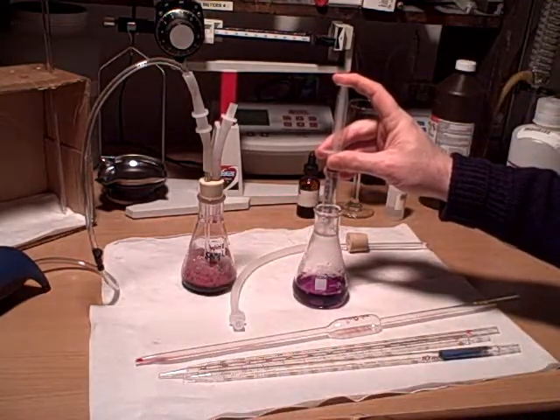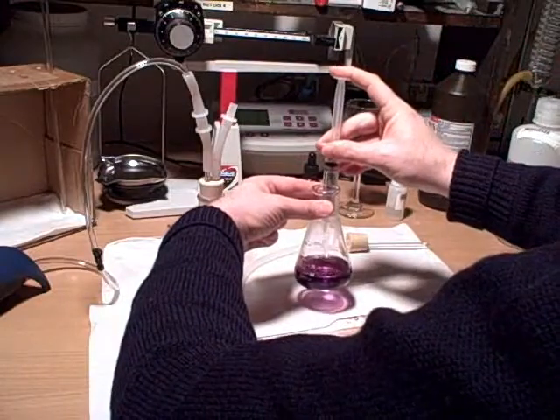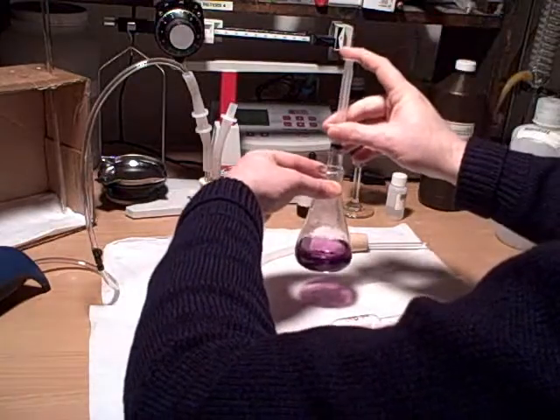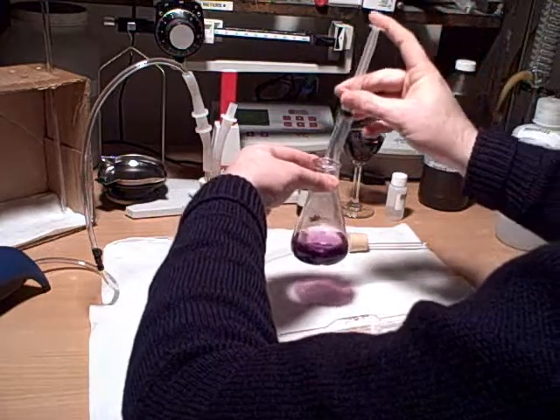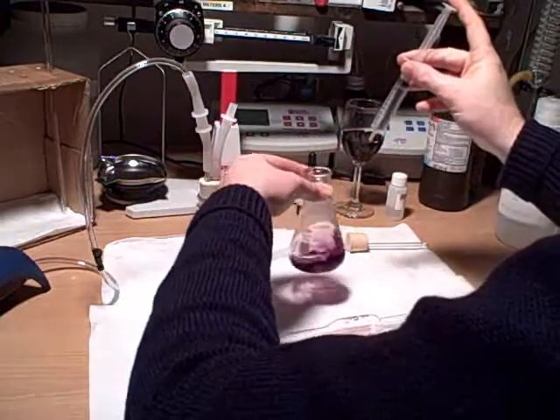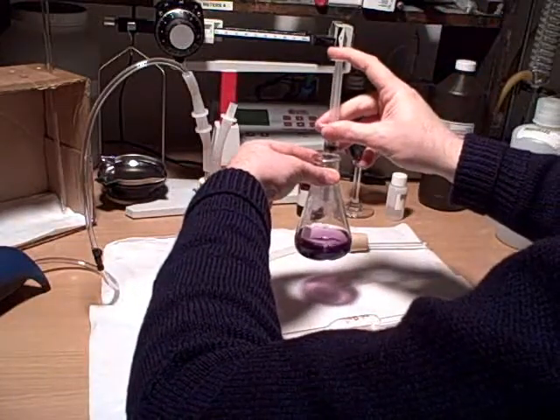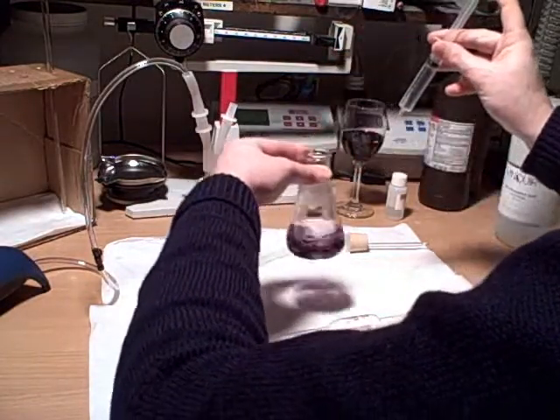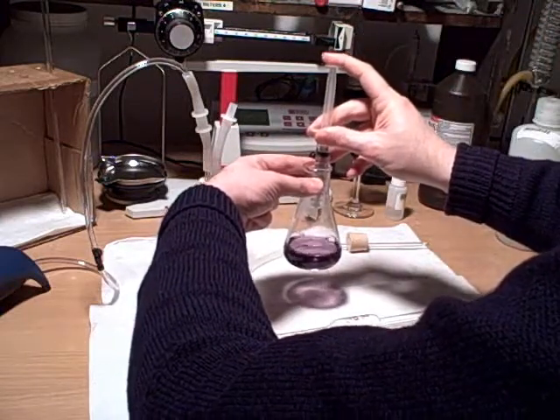I'm going to go ahead and add drop at a time, swirling in between each drop. You start to see that the color now is becoming a little more kind of charcoal-y colored — it's definitely lighter, not quite the bright pink we had before. So getting close to that transition period.